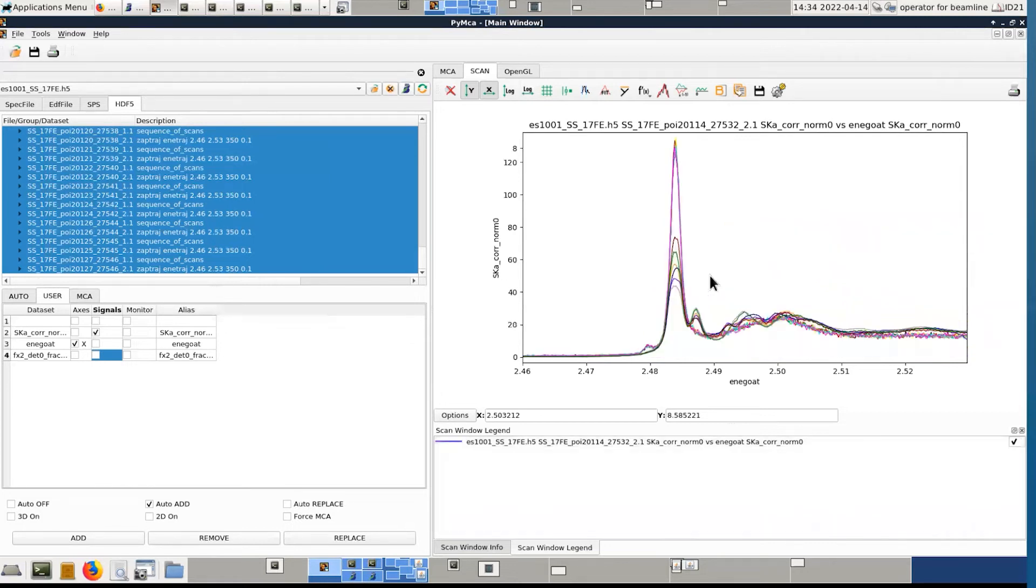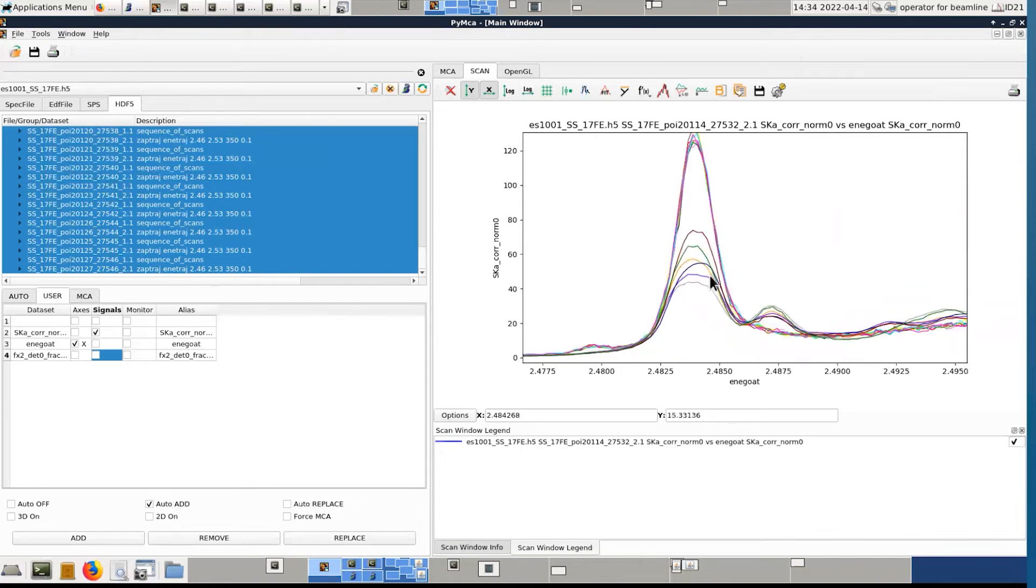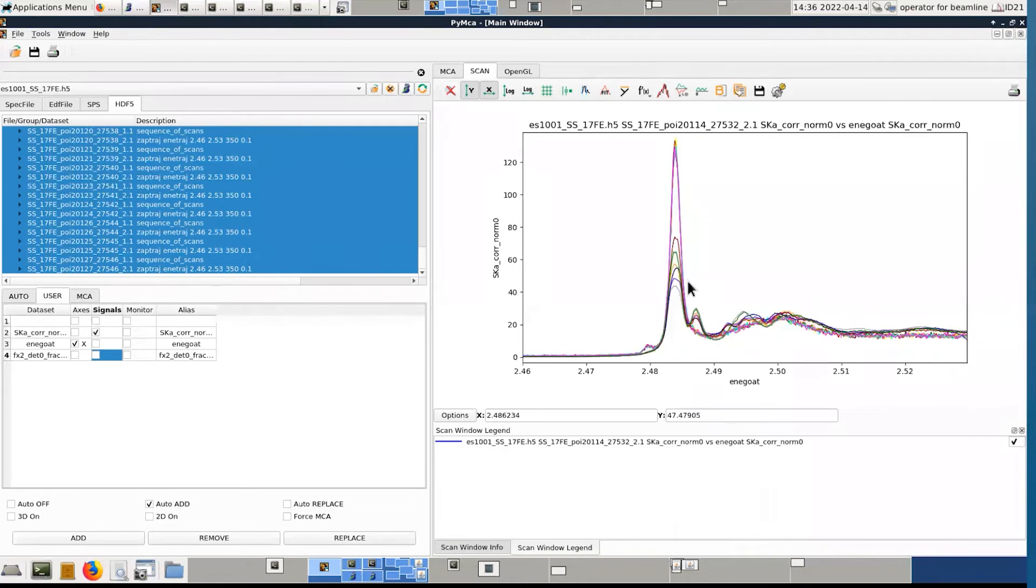And also you have two more options here as well. So usually this one works well. And this way you can also have an idea of the XANES after low quality normalization. So it can be a good way to look for differences between one point and another, one spectrum and another. For example, here it seems that there is a shift for the position of the white line.